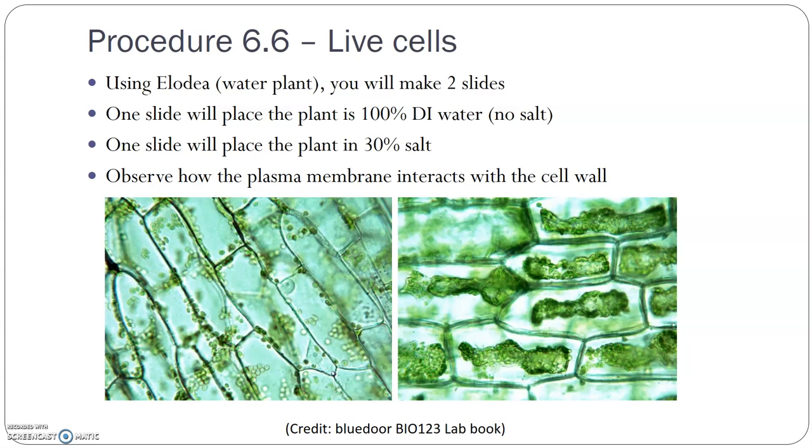Sometimes we don't have that much of this water plant left by this time in the semester. Sometimes it's not super healthy, so usually your instructor will make it for you so you can actually see it. Otherwise, you have these 2 beautiful pictures in your lab book.